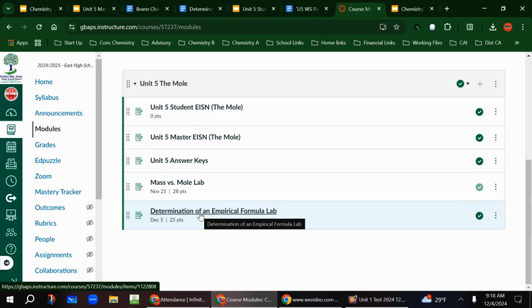Okay. Now, I will warn you that today in the lab, you are going to be working with concentrated acid, as concentrated as it gets. So if you spill it on your skin, it's going to burn your skin. If you spill it in your eyes, there's a possibility that you could go blind. So goggles are on the back right there. You will wear them the entire time while you are in the lab so that we avoid any instances.